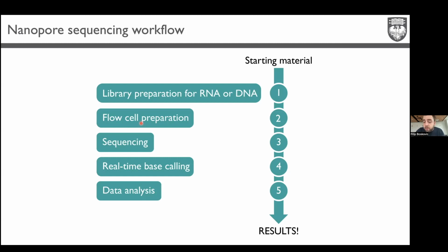First, of course, you need to prime the cell, or prepare the cell. So you need to clean it of the storage buffer, usually some glycerol and some mineral oil. And after that, you just inject your library. It's very nicely guided for you in the workflow. And then once you put it inside, you can just mount it on the device. Mounting on the device is designed so you can't make a mistake. There are 2 holes going here, so you just slide it below. You can push it inside and press, so there's good connectivity. And that's basically everything that you need to do before.